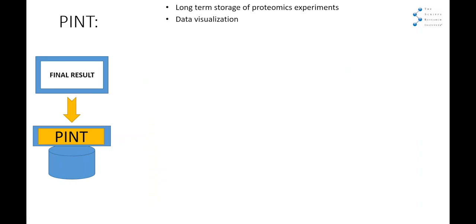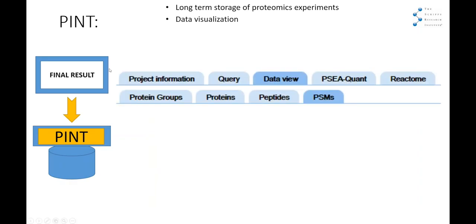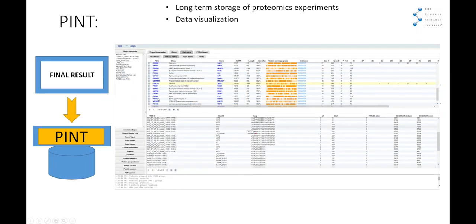Once the data is stored we want to visualize it. We have this data view where we have several levels of visualization: PSM level, peptide level, protein level, and also protein groups level. At the protein level you can see all the proteins with all information about them, and if you click on one protein you will see all the PSMs associated. At the peptide level you will see all the peptides, and if you click on one peptide you will see all the PSMs associated.